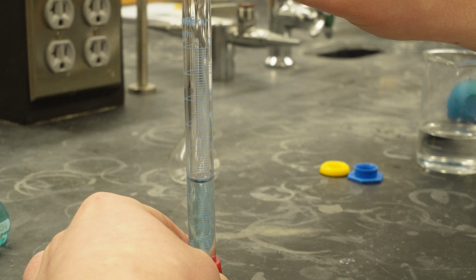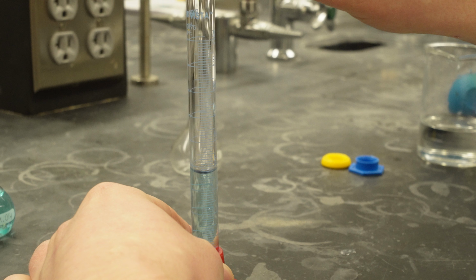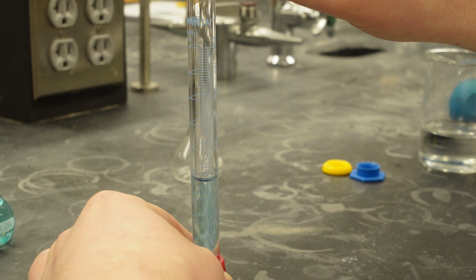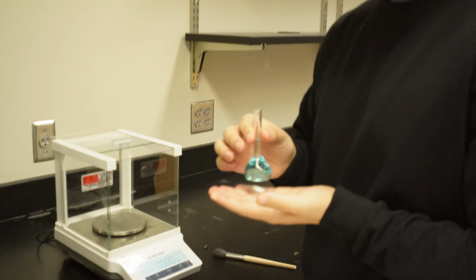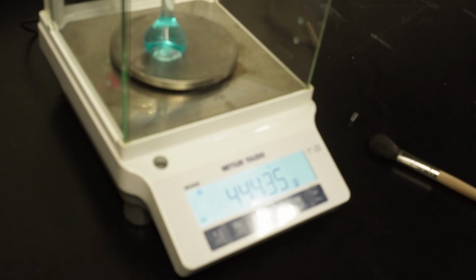Here you can see Crimson measuring out 5 milliliters from our stock solution. We're going to pour this 5 milliliters into another volumetric flask, and it will be diluted to the 25 milliliter mark as well. From there we can calculate the concentration, and then we can keep doing this until we reach our 4 concentrations.